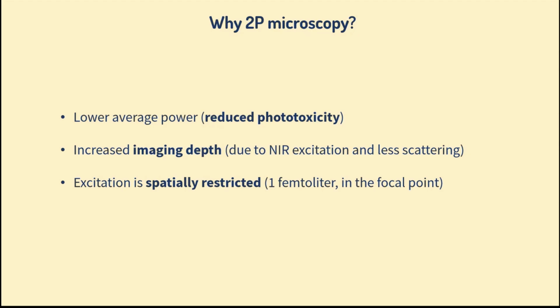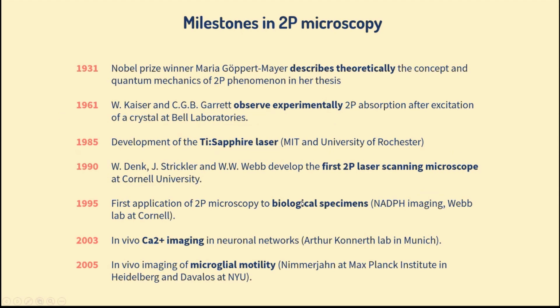And this is very important too. The excitation is spatially restricted, so you will excite only 1 femtoliter in the focal point, and this is very useful for biology, as we will see later in the different applications of two-photon.